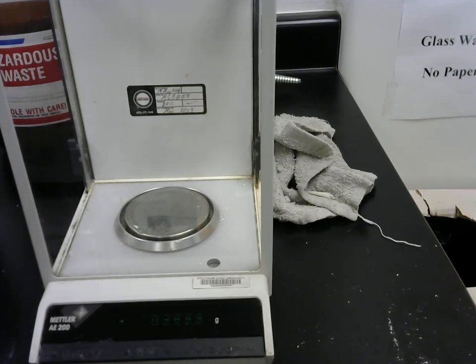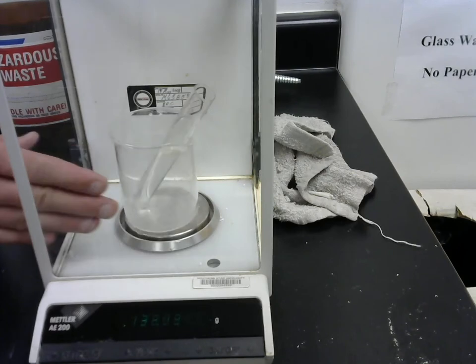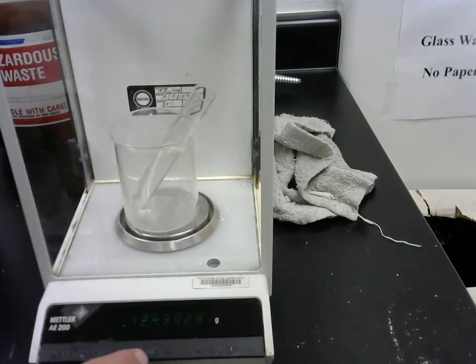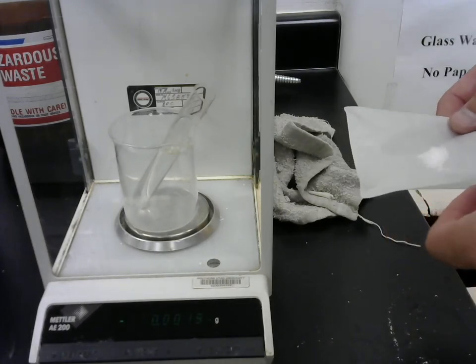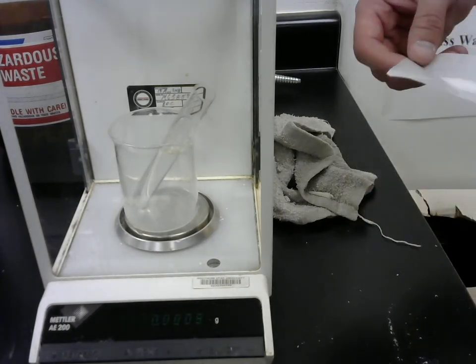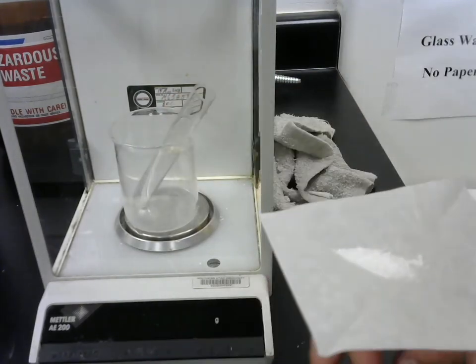Now I'm going to try to be a little bit clever because we really care about the molal concentration here. It will be difficult to get complete transference of the naphthalene into our test tube. So I have tared it yet again to the weight of the test tube together with the cyclohexane.